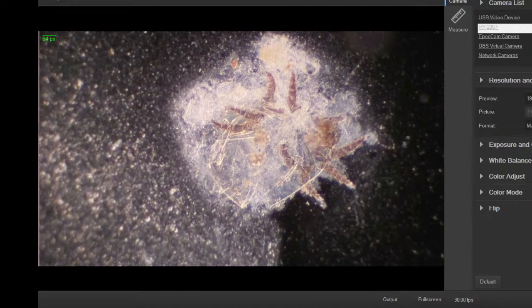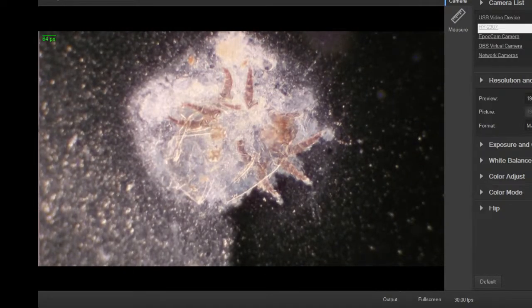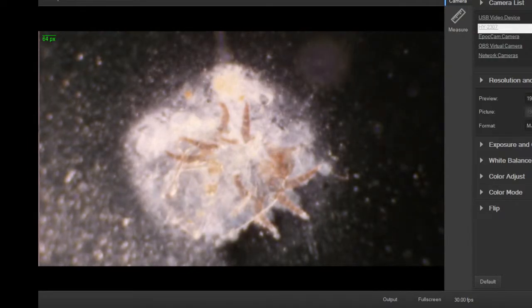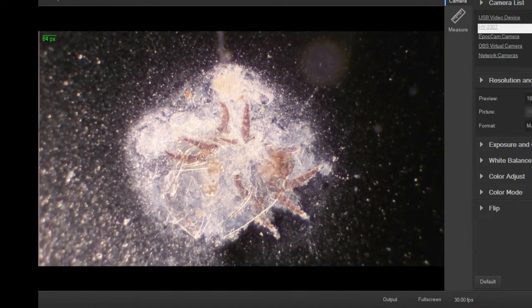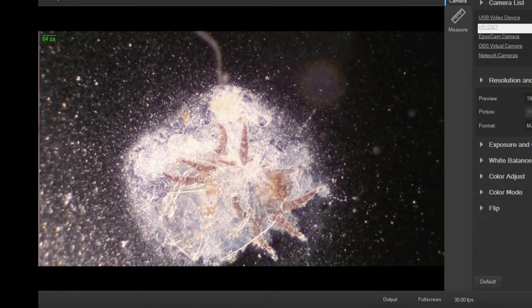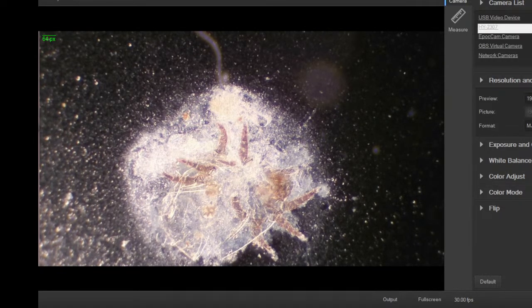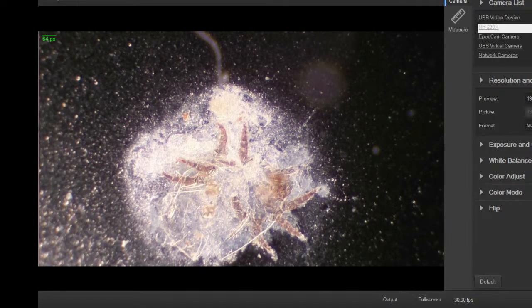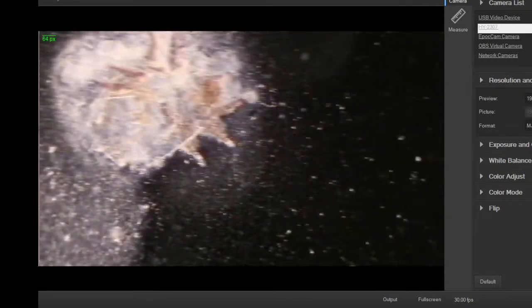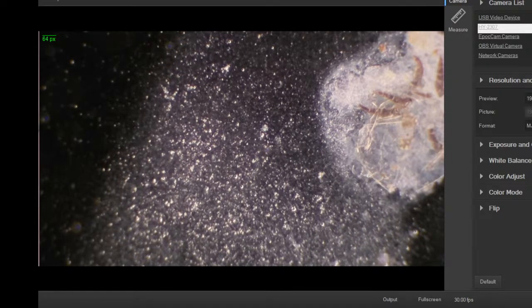I did smash a little bit, though, when I did that. Oops. Sorry, mite. But you can see the legs pretty well there. So it's exactly where it was, but I got a little squash. You can see that debris field there. It looks like a star exploded. To the side, it's off on the inside of the mite.